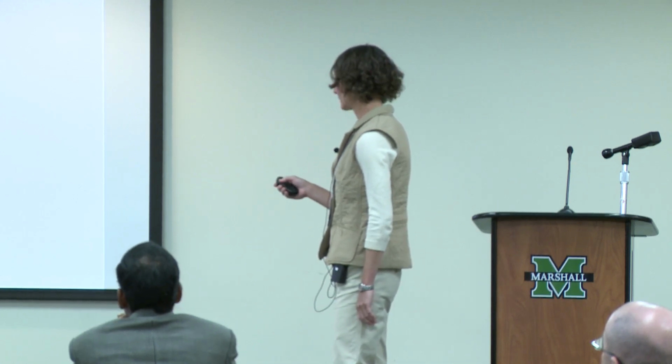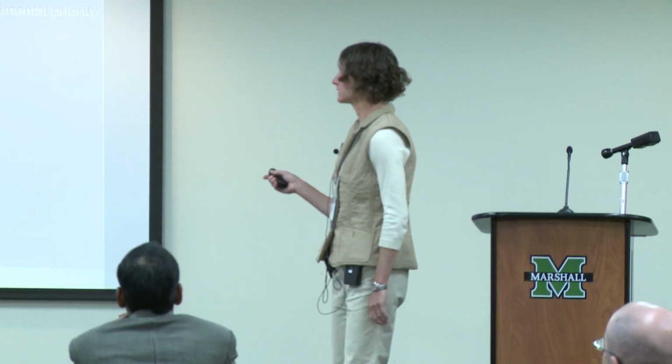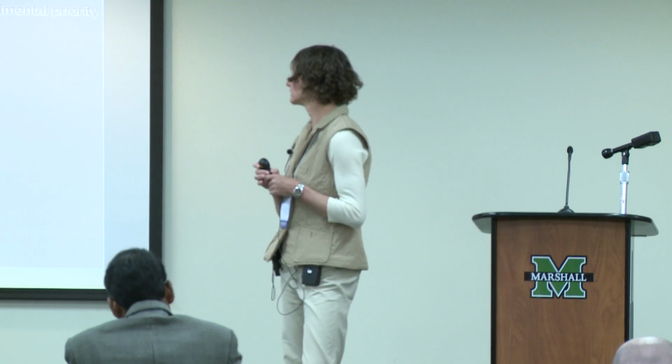I wanted to say one more thing: in one run, we can sequence an entire human genome. The data from one run is about a terabyte. The way we've set up our instrument over there in BBSC is that in real time, through Jan Fox's Internet 2 connection, it sends data over to the IT department here in Drinko, and Ed and his team have set up our server, which deals with all of our data storage and data transfer. Without them, we wouldn't be able to do the sequencing runs that we do.